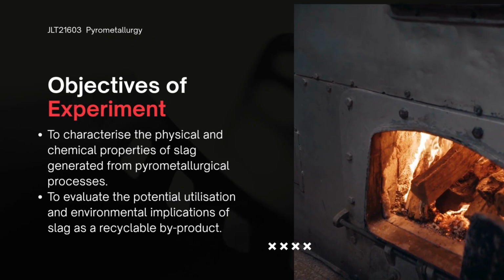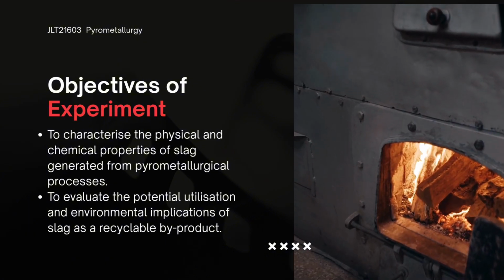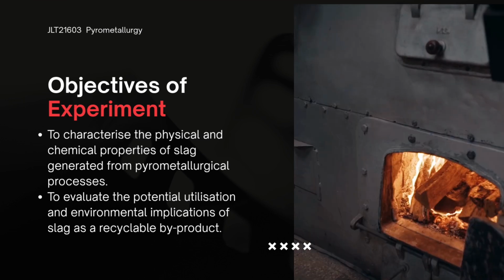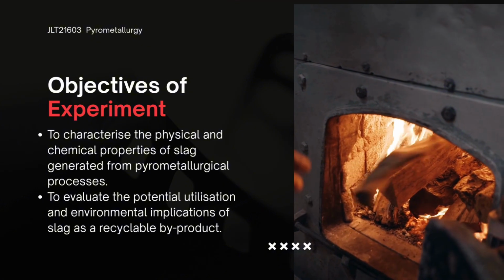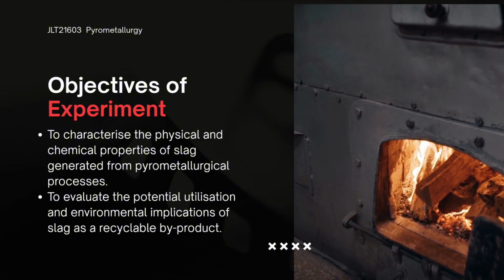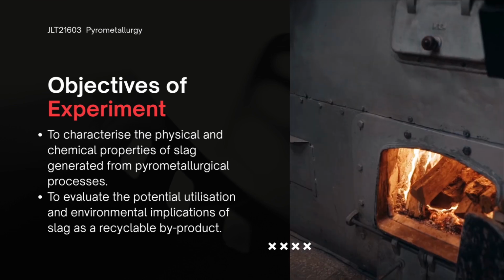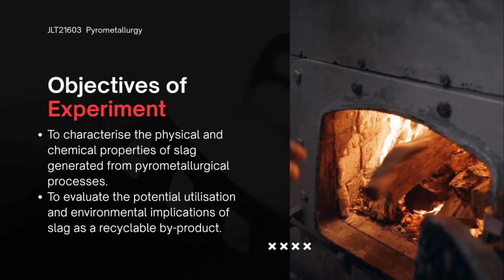The objectives of this experiment are, first, to characterize the physical and chemical properties of slag generated from pyrometallurgical processes. Second, to evaluate the potential utilization and environmental implication of slag as recyclable byproducts.